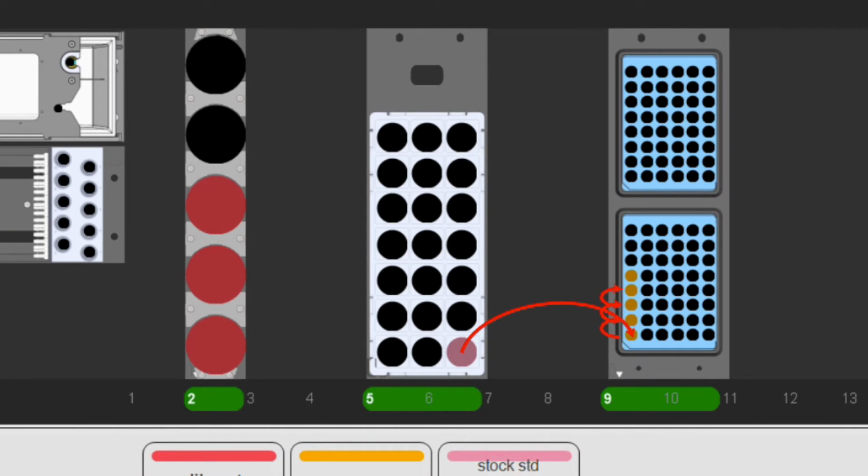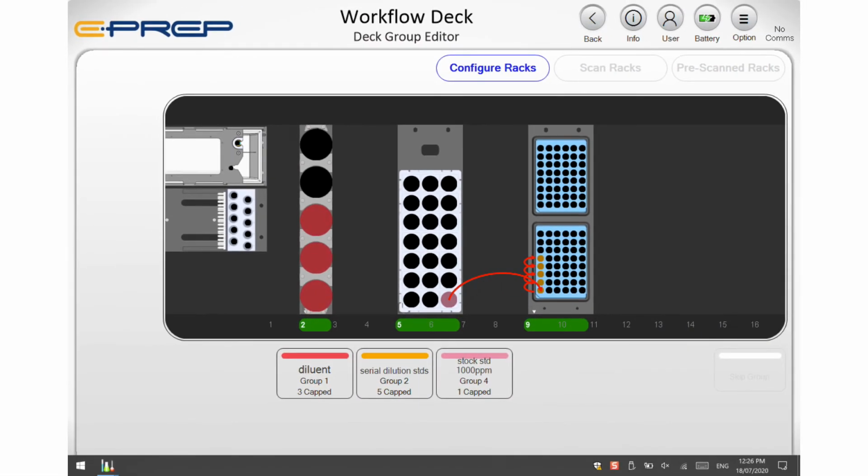It is very common to include a mixing step after the volume addition to ensure the vial contents are thoroughly mixed before aspiration of an aliquot for the next step. The vortex mixer is commonly used for this purpose. An example of this is as follows.